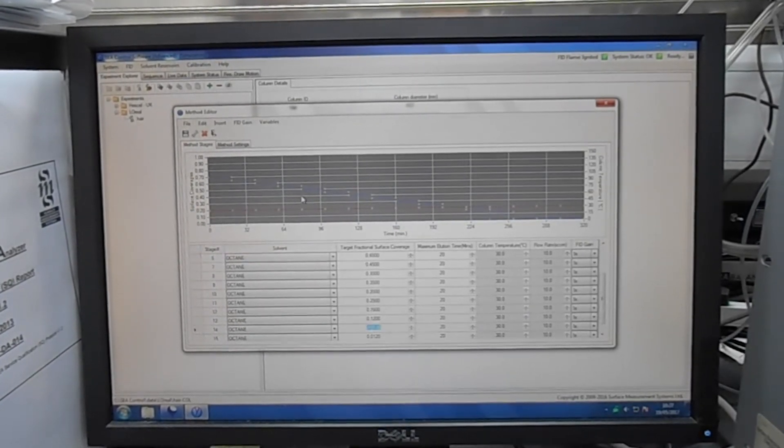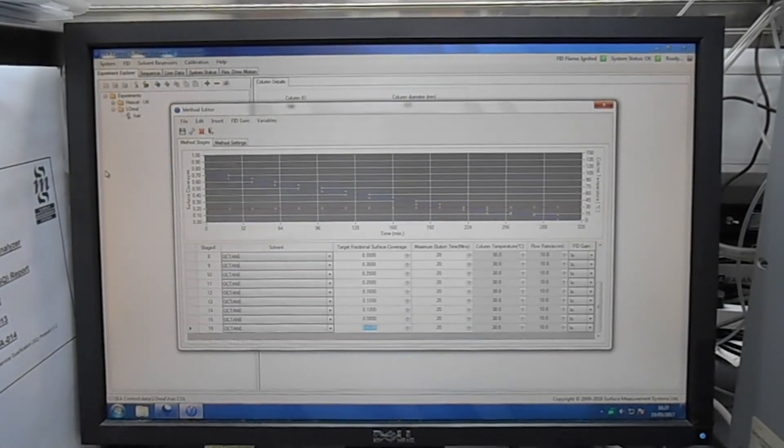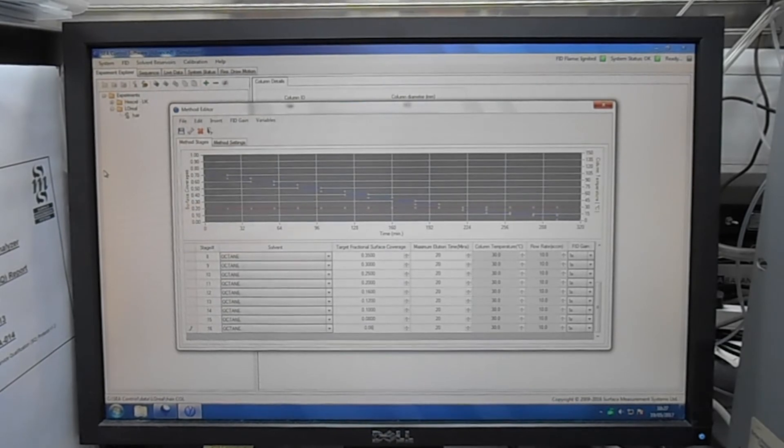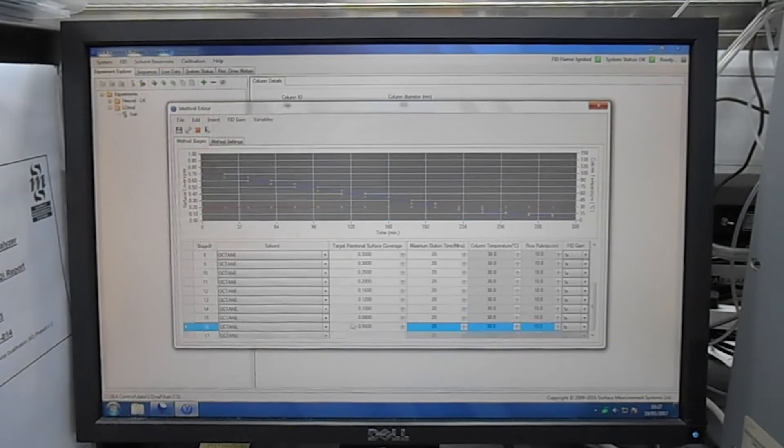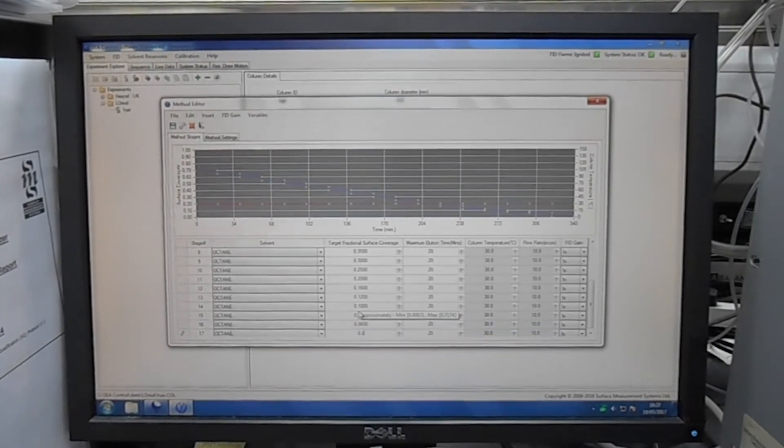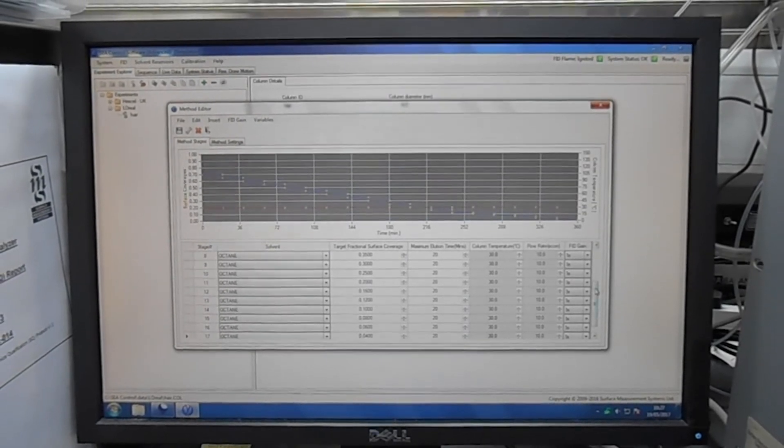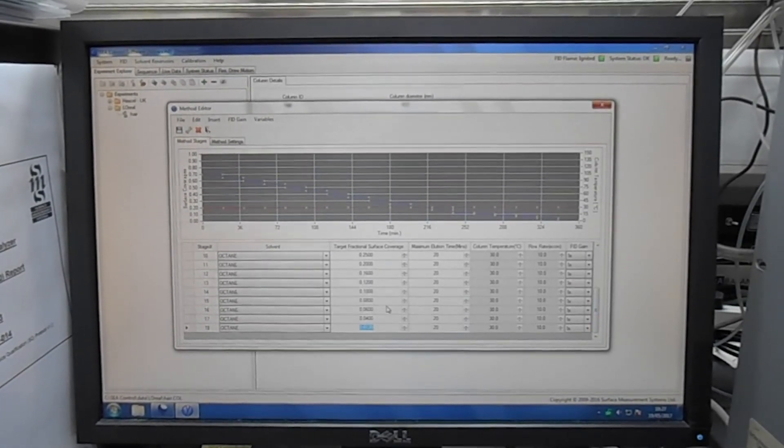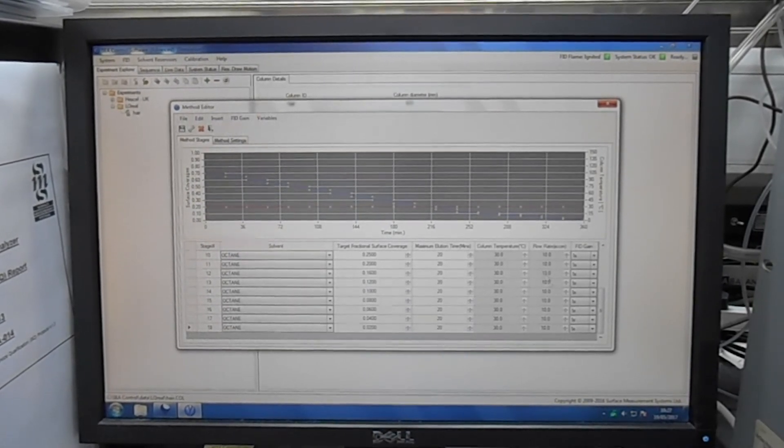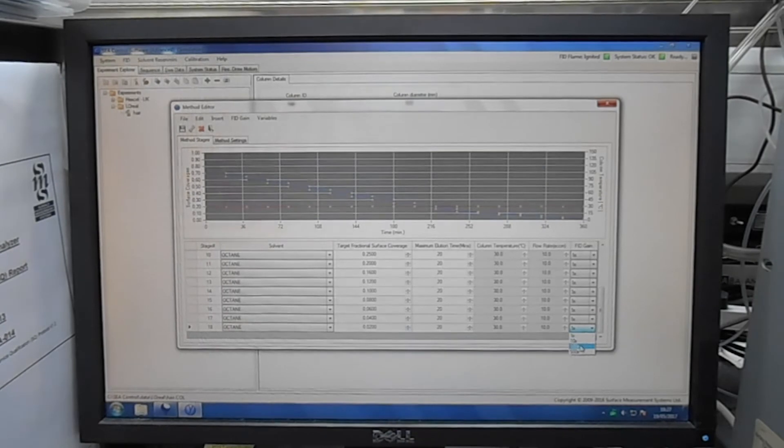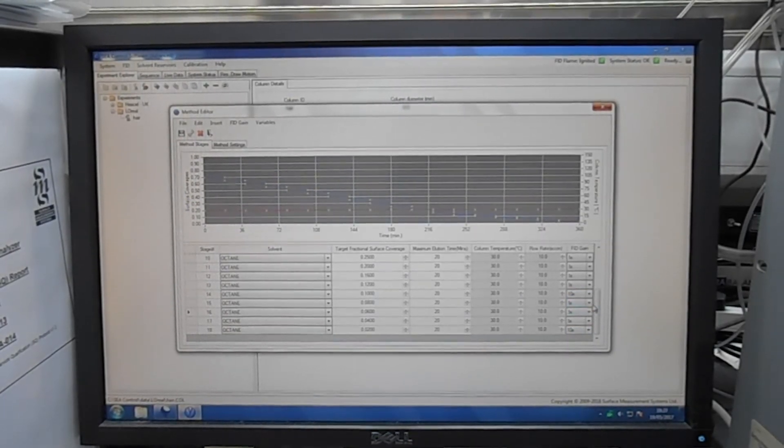And after I finish changing each single step I actually enable the FID gain for the measurement of the octane and I increase the gain for the steps that had very low volume of injection of octane itself. Most of the time a gain of one for FID for octane is more than enough but for very small volume injections we usually increase the gain to 10.